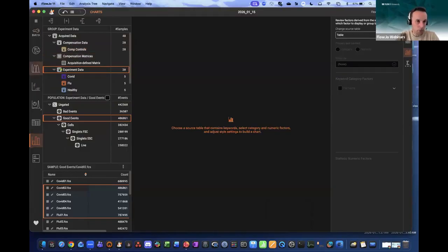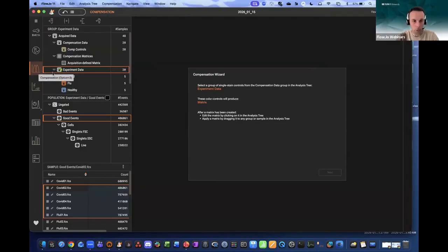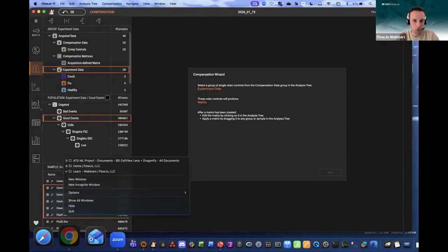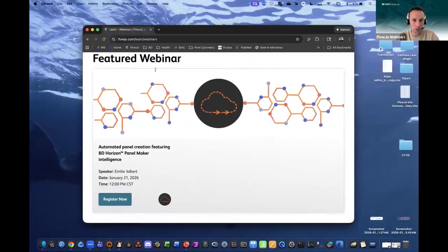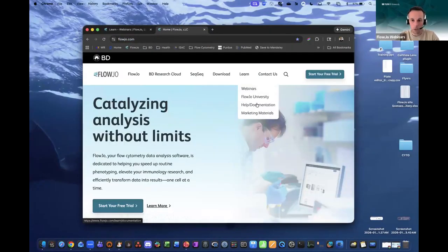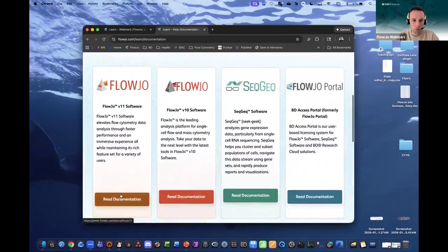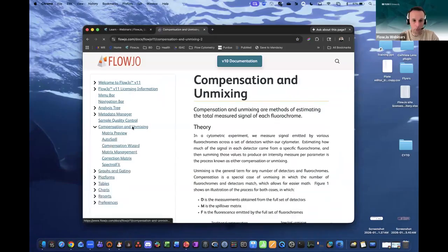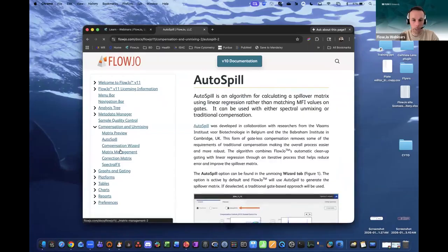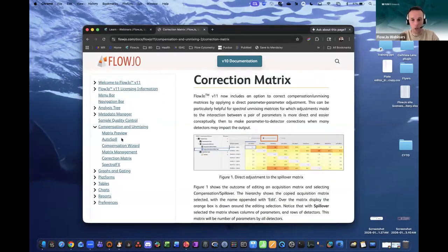And Justin, for compensation, I'm not going to go into too much detail. If you want to know more about compensation, there's a webinar on compensation in FlowJo 11, or you can go on our website, documentation. Did I close the window or did I leave it? Oh, there you go. If you go on flowjo.com, in the Learn tab, you have help documentation for FlowJo 11, and you can go in compensation and unmixing. And here you're going to have all the explanation on how to calculate your unmixing compensation in FlowJo.